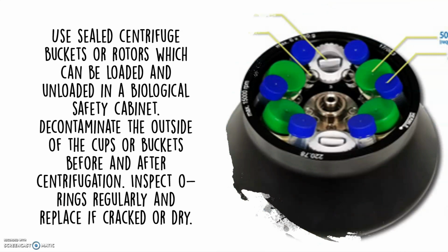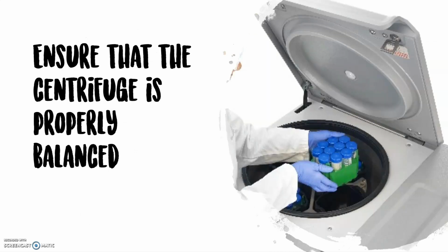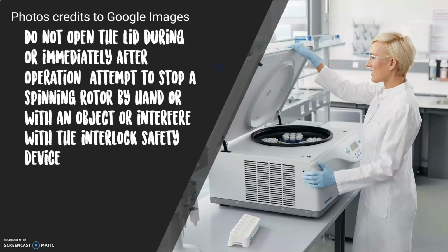Use sealed centrifuge buckets or rotors, which can be loaded and unloaded in a biological safety cabinet. Decontaminate the outside of the cups or buckets before and after centrifugation. Inspect O-rings regularly and replace if cracked or dry. And of course, make sure to ensure that the centrifuge is properly balanced.